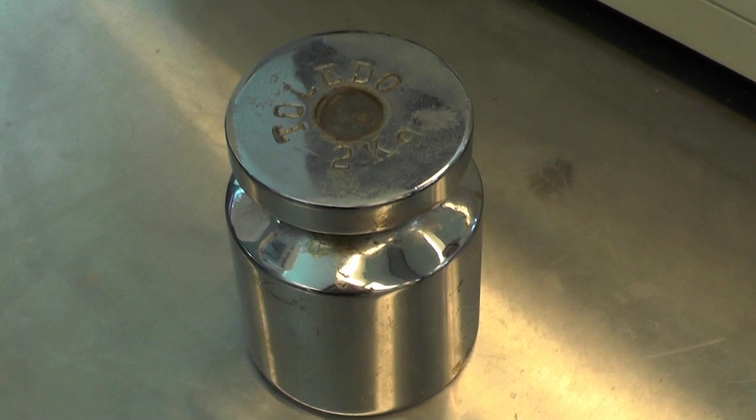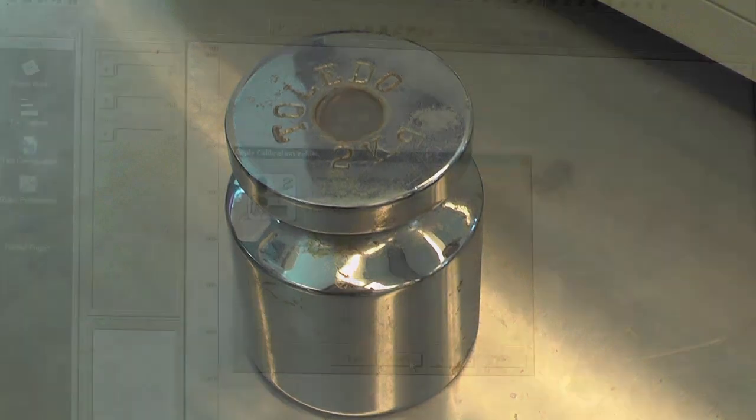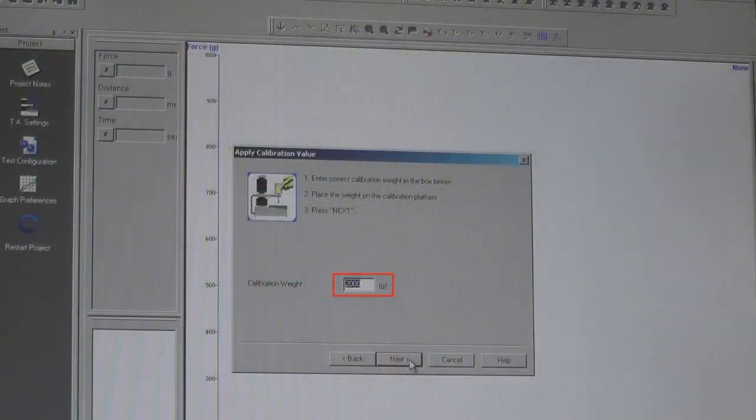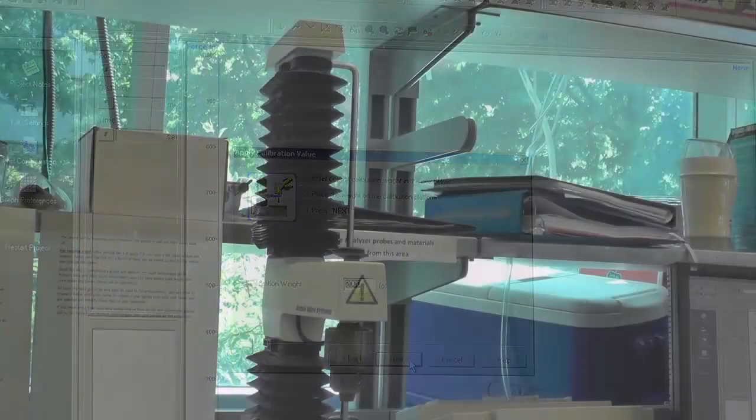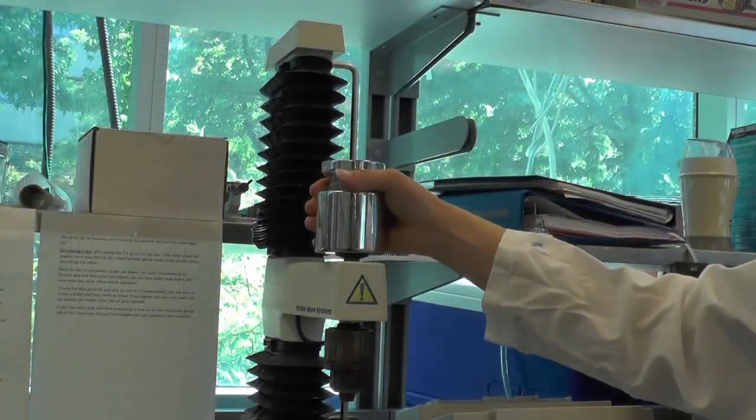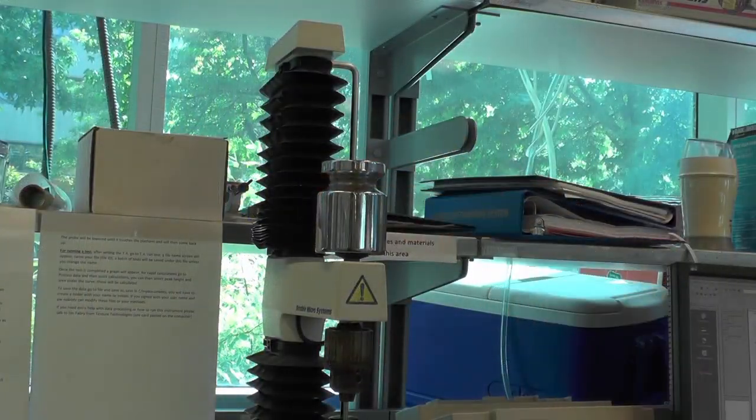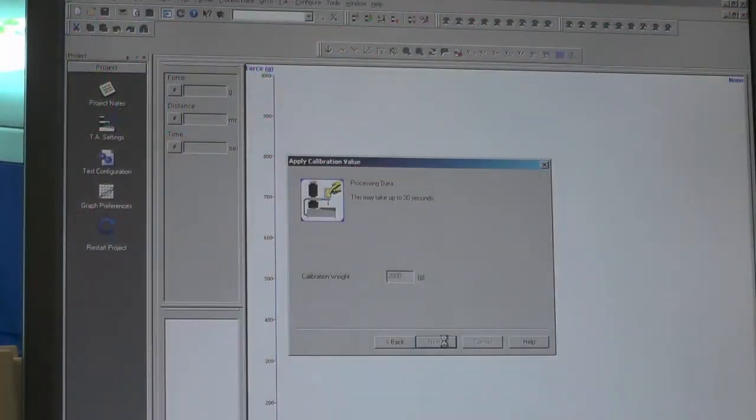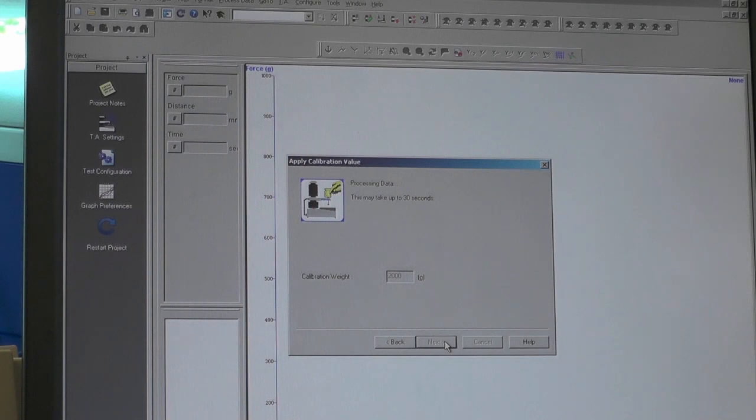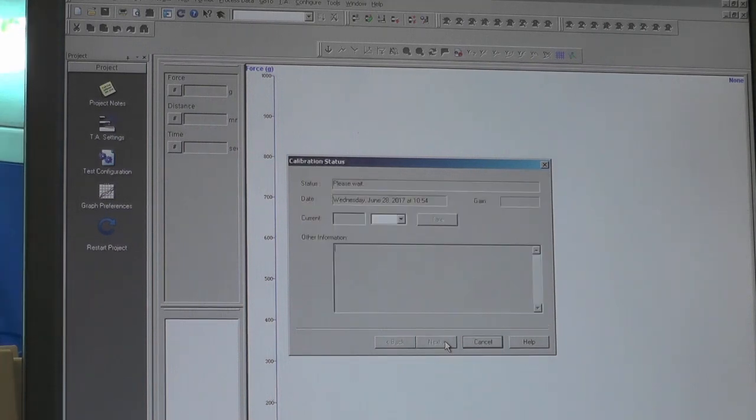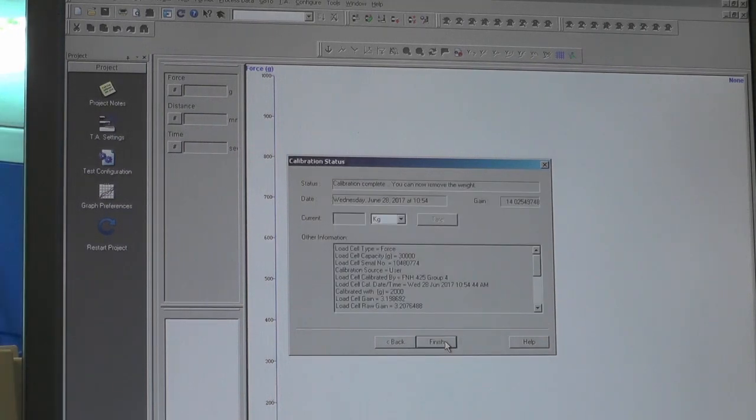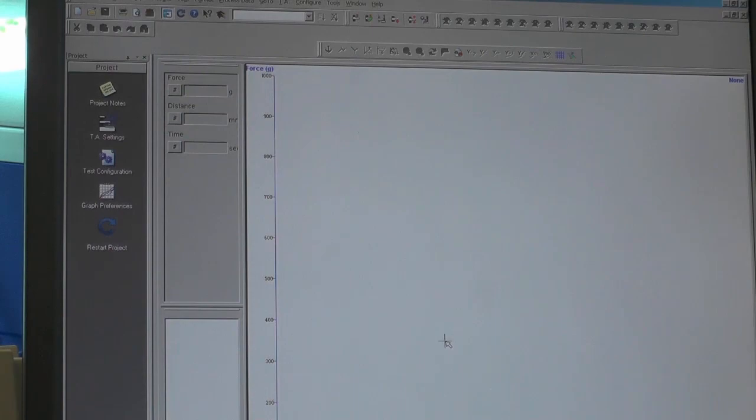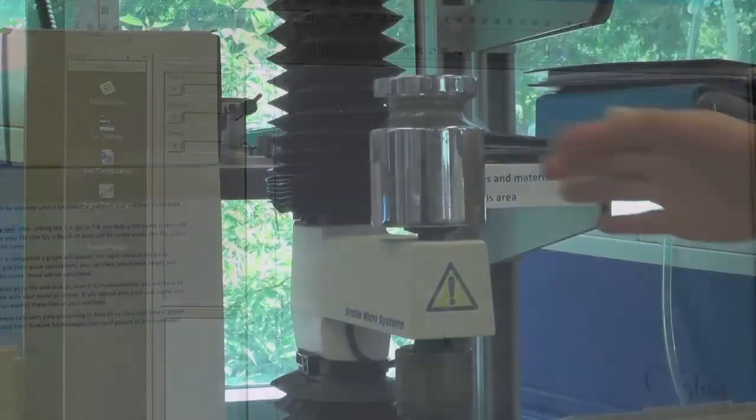In this step, you will need to use a calibration weight. Enter the calibration weight value in grams, and then place the weight on the calibration platform. Click Next and wait until the calibration is complete. When it's finished, click on Finish and remove the weight.